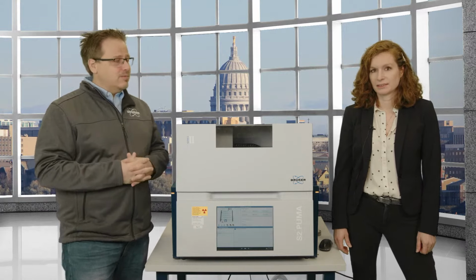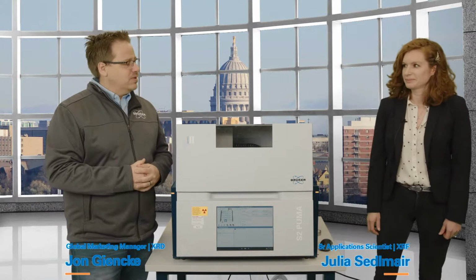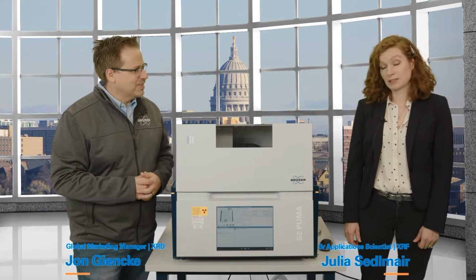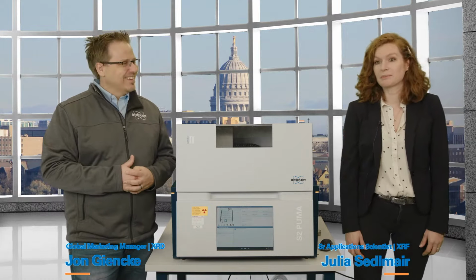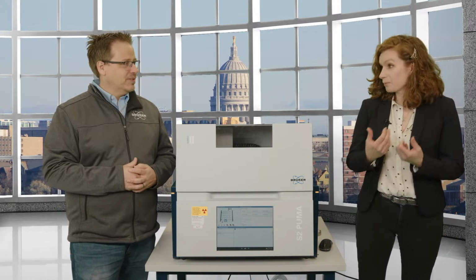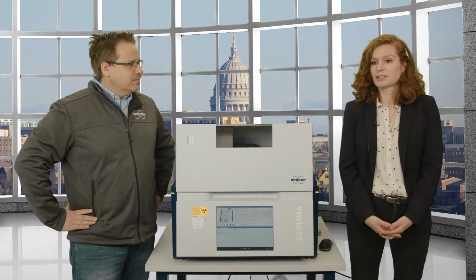Now today I am joined by Julia. Hey, John. And she is our expert in X-ray fluorescence spectrometry. People say spectroscopy, but that's only the qualitative part because you see. Scope, Greek, from seeing, whereas we actually measure how much is in something, so it's spectrometry.